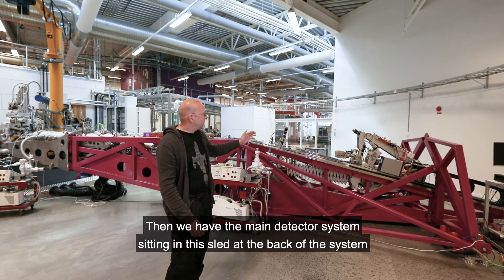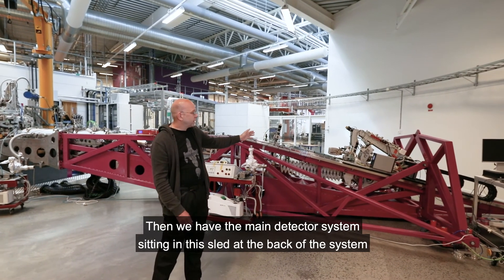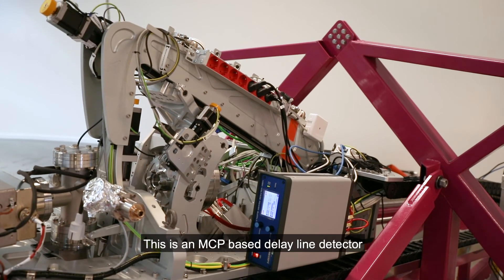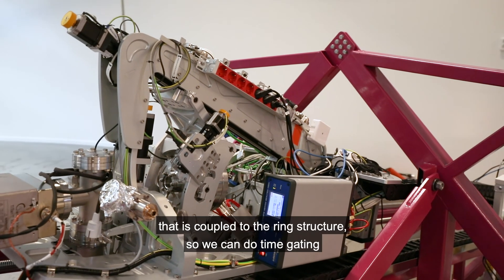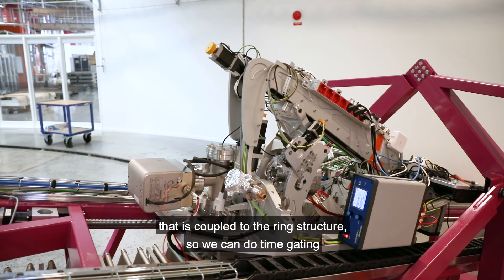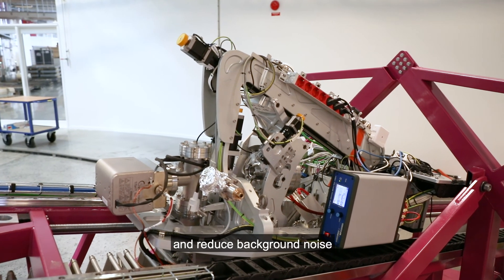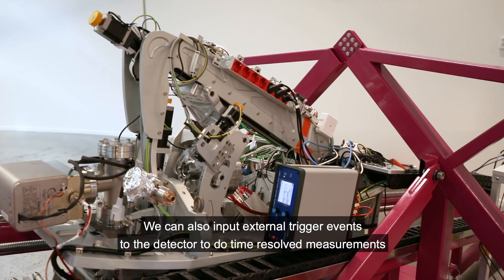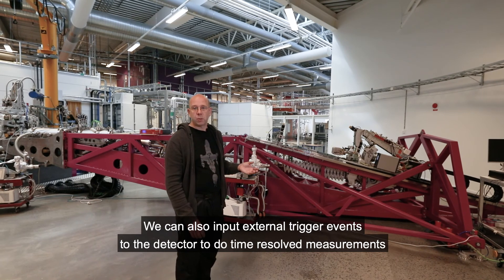Then we have the main detector system sitting in this sled at the back of the system. This is an MCP-based delay line detector that is coupled to the ring structure, so we can do time gating and reduce background noise. We can also input external trigger events to the detector to do time-resolved measurements.